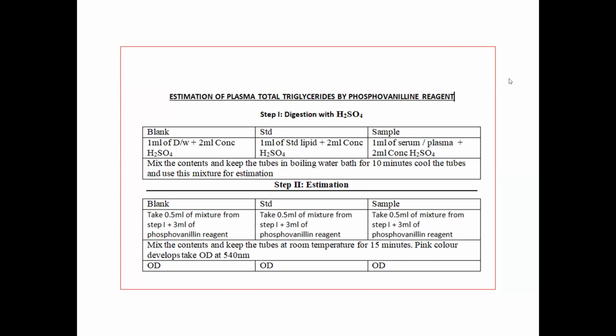So whenever you are keeping the test tubes into the boiling water bath, you should be very careful. You will be plugging it with the cotton. I have already taught you how to make the cotton plug, and if you don't know, the recorded video is also there, you can see it. But make sure before keeping it into the boiling water bath, you plug it with the cotton carefully. Then after that, you will be using this particular mixture for the estimation.